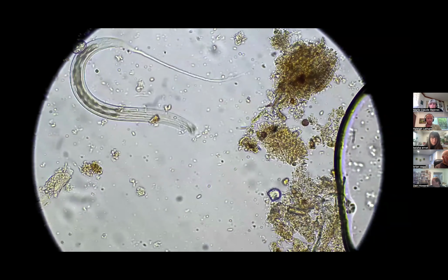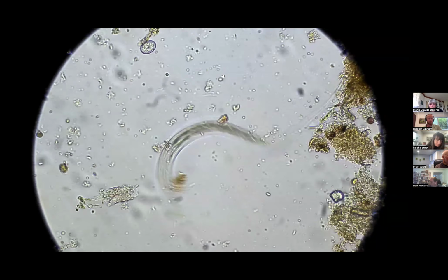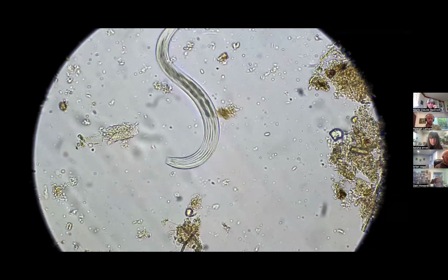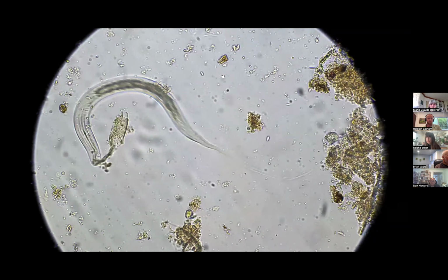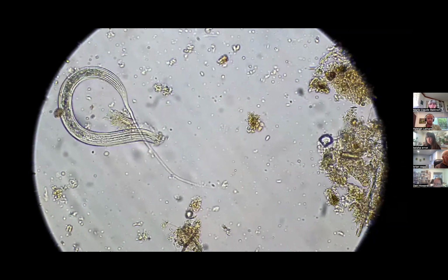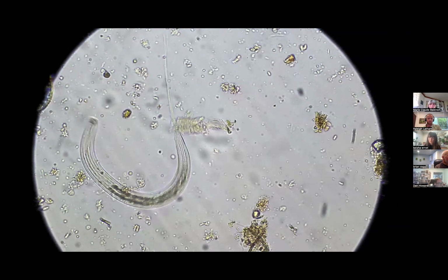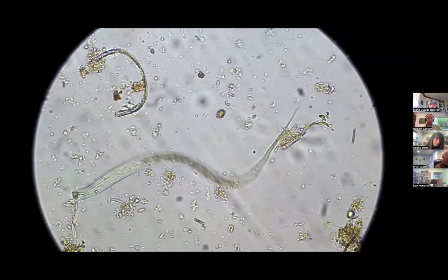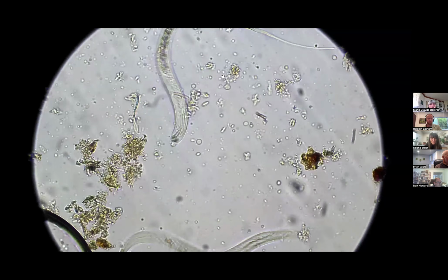So the sample we're looking at here is from a vermicompost, and right now I'm zoomed in at 400x total magnification, and I'm thinking that this is actually a predator nematode. Looking at that mouth part, it's hard to see. You guys see it okay? Is it coming across clear or not?